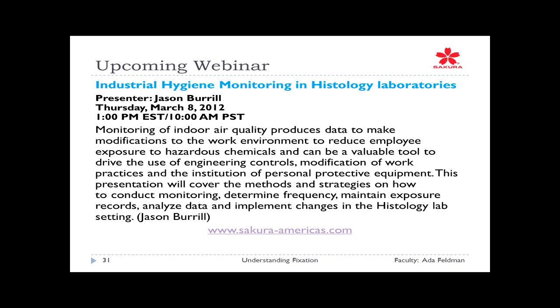The first question is, is the 7 hours related to total processing time or just time in fixative prior to being placed on the processor? It would be total processing time. However, I would say this: if the specimen is being grossed, and we're not dealing with biopsies here, just imagine you get a colon resection in and it's now being grossed and it's raw, you can't count the time it was in the specimen container, because that's not the specimen that's being processed.